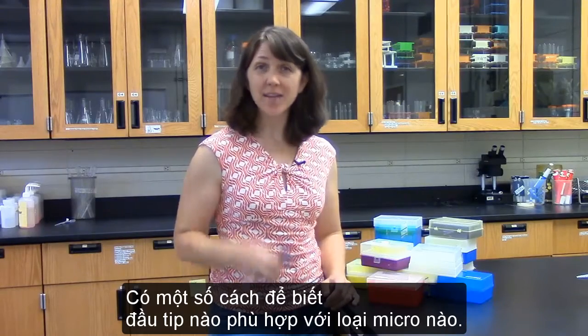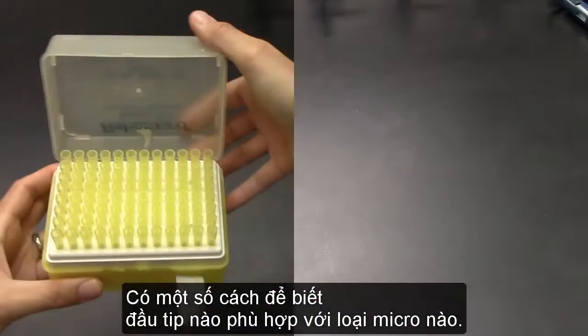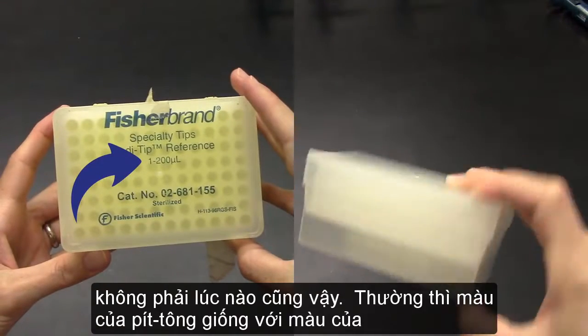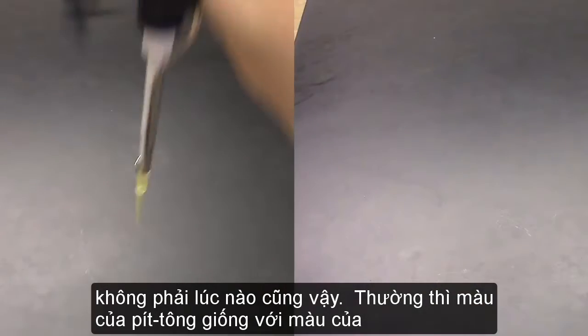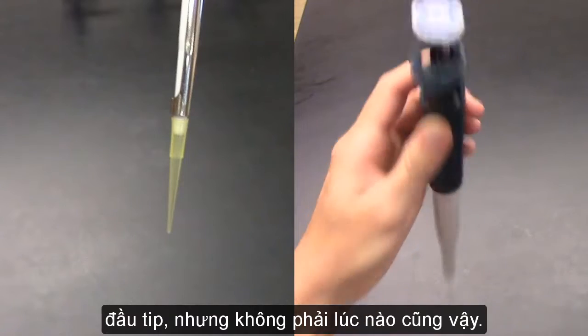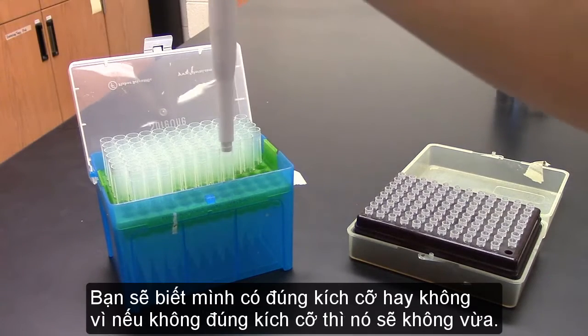There are a couple of ways to tell which tips fit on which micropipettes. Sometimes the tip box says what size tips they're for, but not always. Often the color of the plunger is the same as the color of the tip, but not always. You'll know if you have the right size tip, because if it's not the right size, it won't fit.